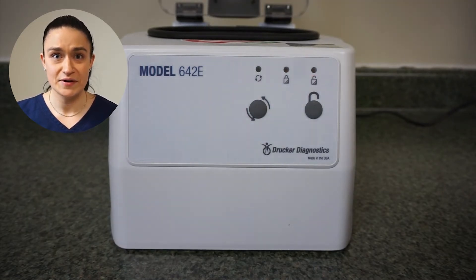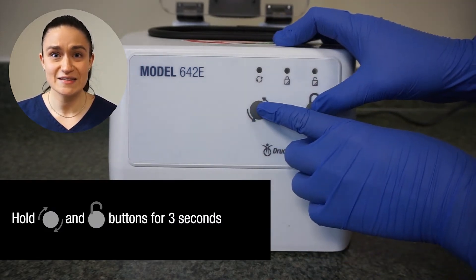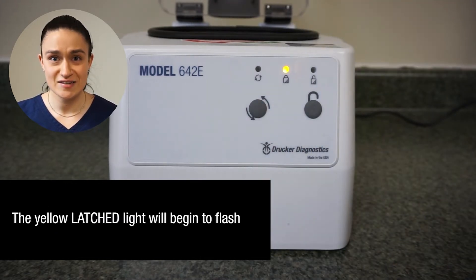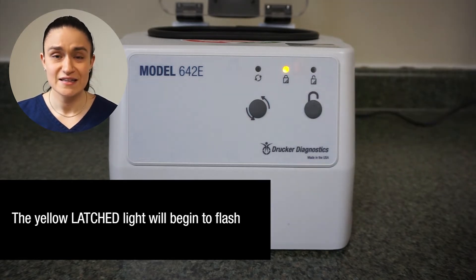Next, enter edit mode by pressing and holding both the start button and the stop/unlock button for approximately three seconds. You should see the center yellow LED begin to flash slowly. This indicates that you are in edit mode.